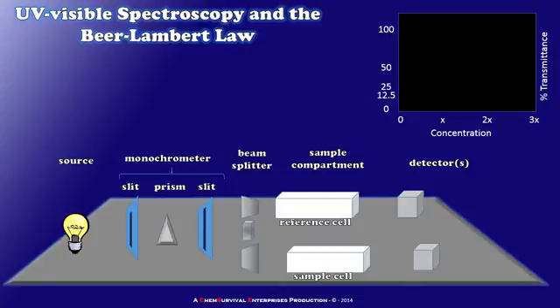Today I'm going to give you a brief introduction to UV visible spectroscopy and the Beer-Lambert law. To begin our discussion, I've drawn a schematic on the bottom half of this screen depicting a fairly typical setup for a UV visible spectrophotometer.